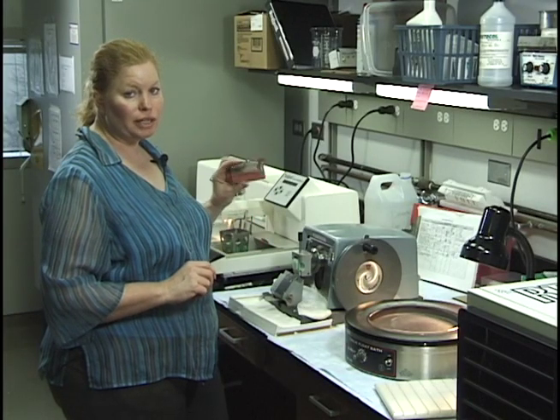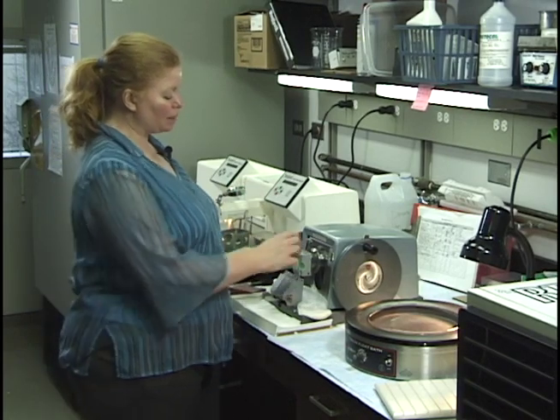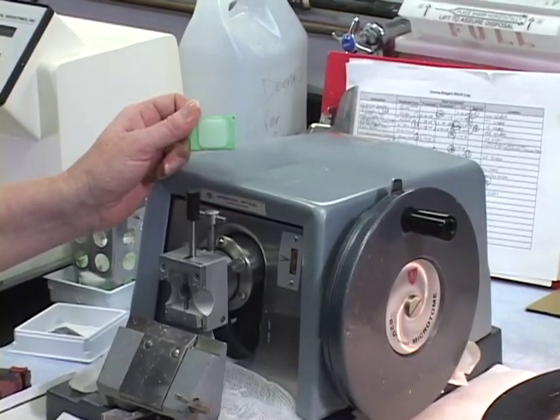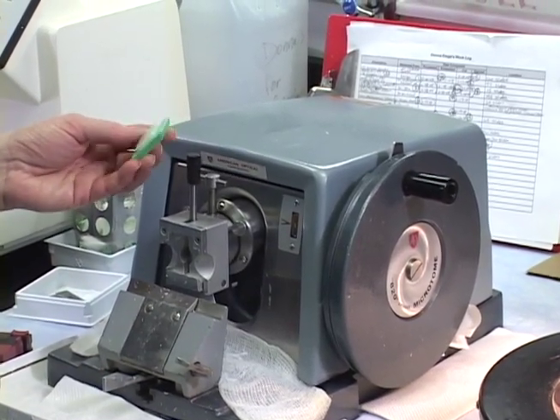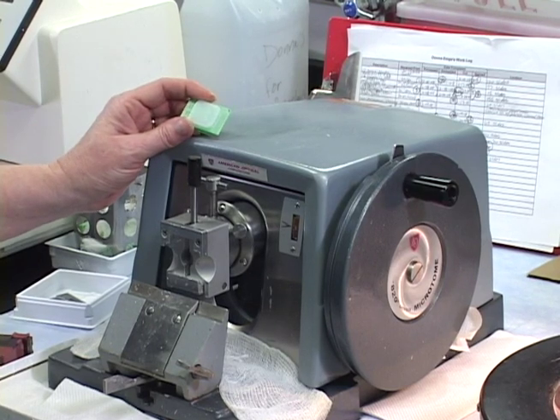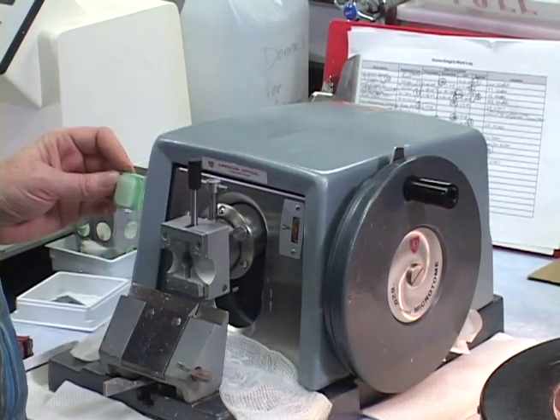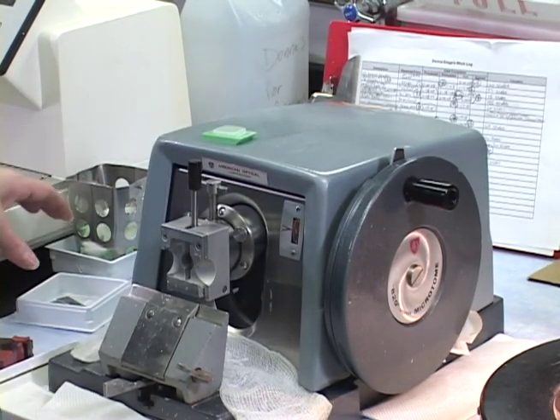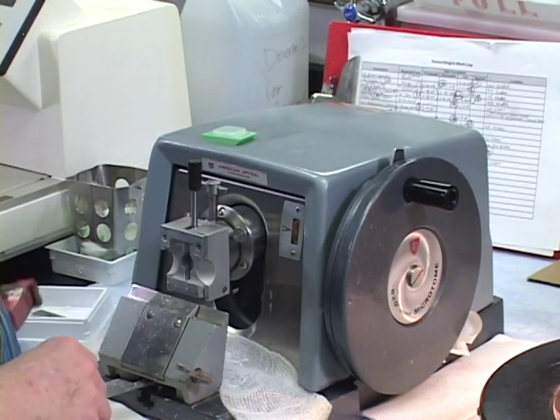For getting good quality sections, I use a fresh blade every time. On a full medium sized block of this type, I get several sections. You kind of judge that on whether you're starting to see lines or paraffin buildup or whatever, whether you need to move the blade over. I would say a good 20 to 30 sections per blade easily to get quality sections. You just learn to judge that by looking at your sections and the quality you're getting. Then once I get my full sections, I save that blade, and later on I'll use it for facing and discard it at that point.